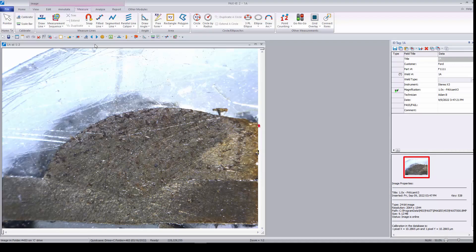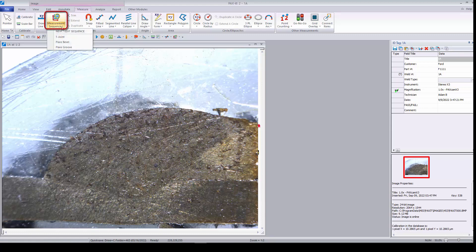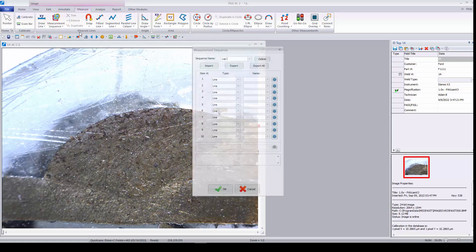Once captured into Paxit, images are ready to be measured. The most useful tool for cut-and-edge inspection is the measurement sequence. Rather than select different measurements from their icons in the ribbon, users can instead order their measurements with custom titles into saved sequences, ensuring quick, reliable, and repeatable measurements from weld to weld.